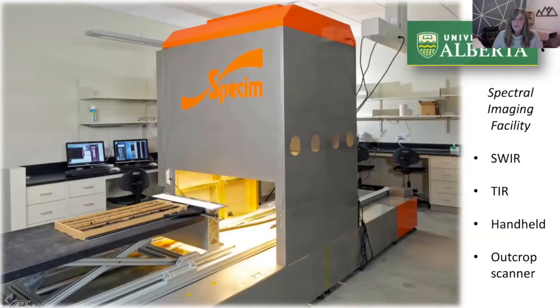This is the lab that I've been working with. This lab is run by Dr. Benoit Rivard at the University of Alberta. MacEwan and Alberta are both in Edmonton, across the river from each other, so it's pretty easy to work together. And this spectral imaging facility has 2 core scanners that look like this. These are SisuROCK scanners. This one is the shortwave infrared, and there's also a thermal infrared just beside it that images in the longwave infrared range. They also have a handheld spectrometer and an outcrop scanner.